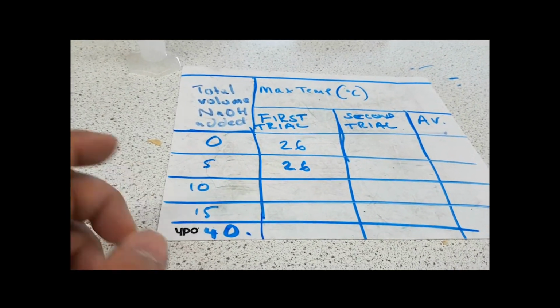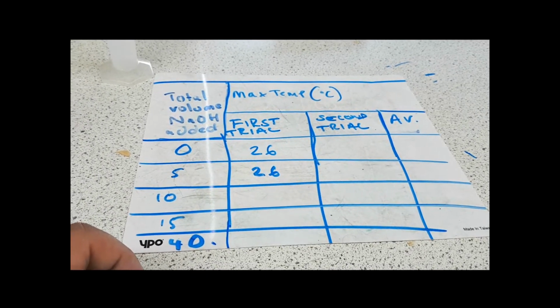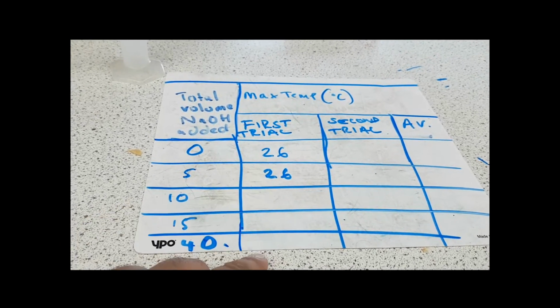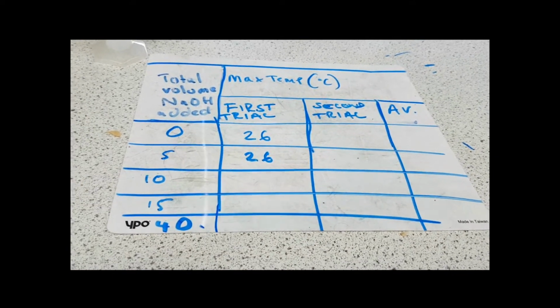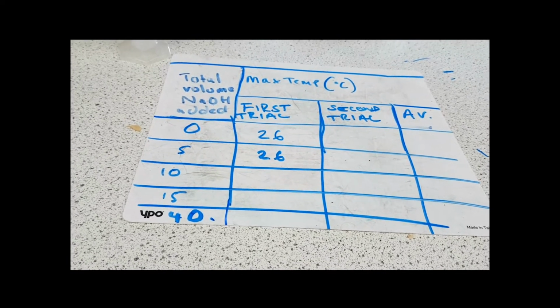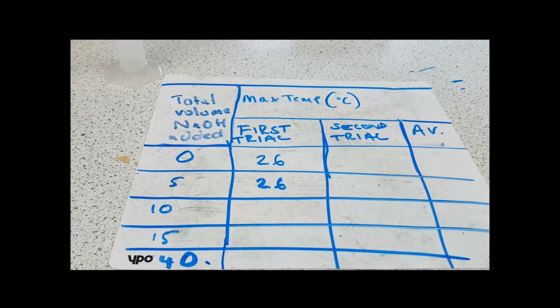Then you have to decide whether this is an exo or endothermic reaction. You'll know if it's an exothermic reaction because the temperature will go up, and you'll know if it's an endothermic reaction because the temperature will go down. A very simple procedure, very simple experiment. And again, this is for exo and endothermic reactions.